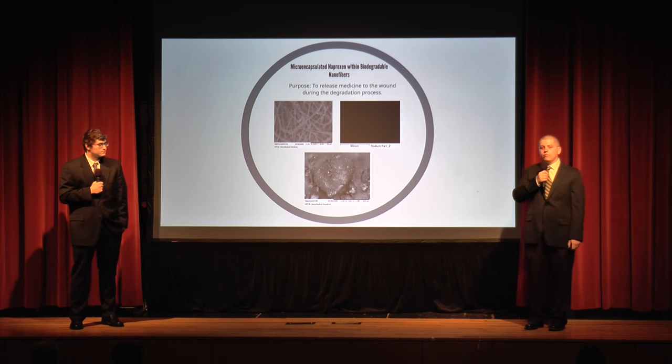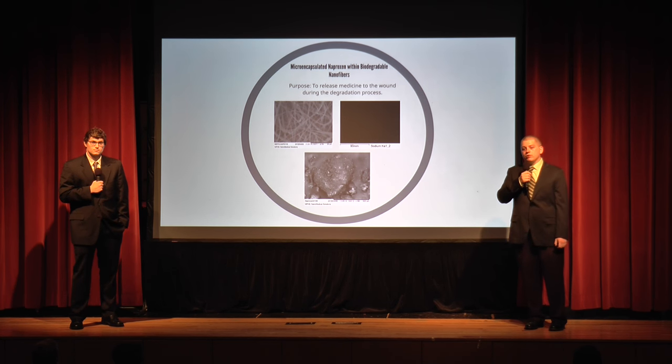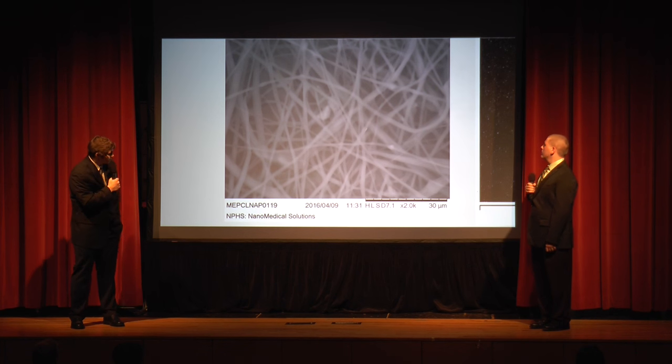Microencapsulation combines methods from both medicinal encapsulation as well as cellular scaffolds to form fibers that trap particles of naproxen within them. This is an SEM image of our fibers. The large particles that protrude from the fibers are naproxen particles.